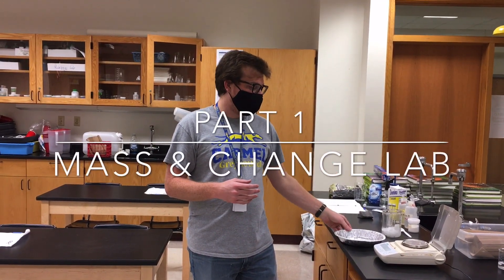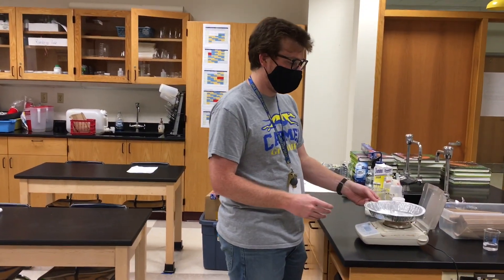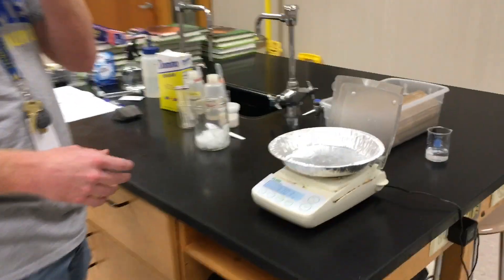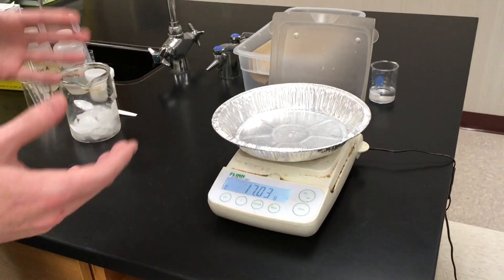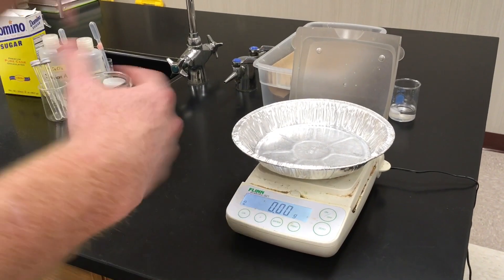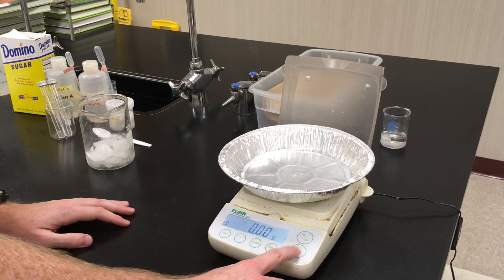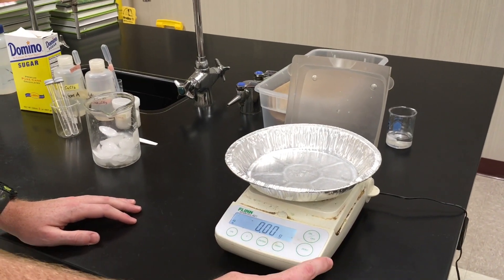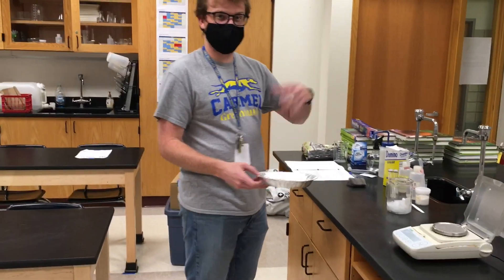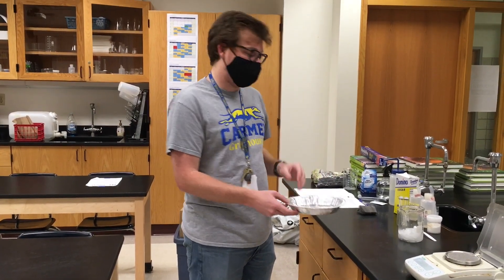So in part one, we are going to start off by zeroing our balance. What that means is we're going to put our container — in this case it's just this foil dish — and then we're going to hit zero on our balance. What that does is it takes away the mass of our little dish, so we can actually find the mass of our steel wool itself. So now it's ignoring the mass of the dish and we can just find the mass of whatever we add to it.